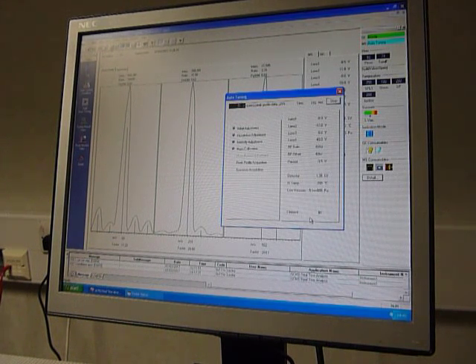It's got two filaments in the system. So when one filament blows, which they invariably do, you can turn over to filament two for another six months or whatever, depending on usage. Eventually you have to replace them both. But with our engineers working throughout the country and even into Europe, servicing these instruments and getting fully up to speed.